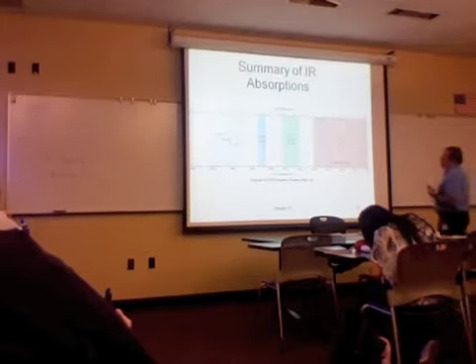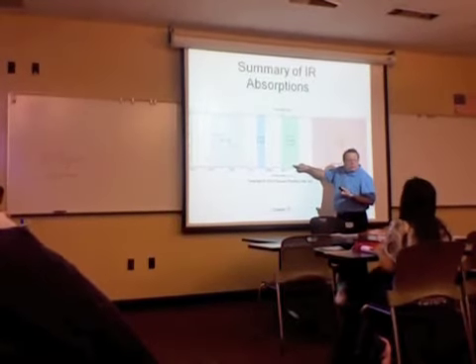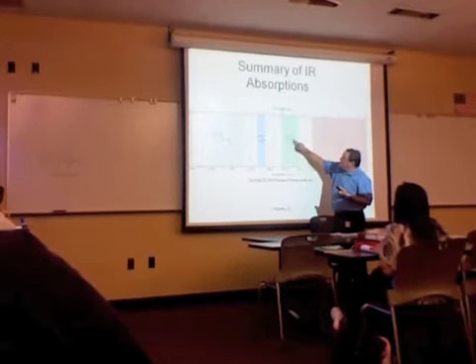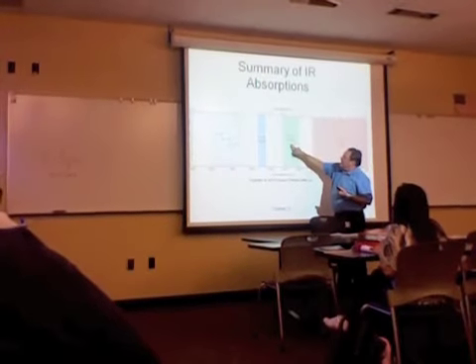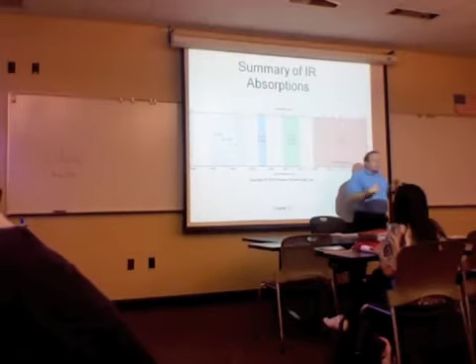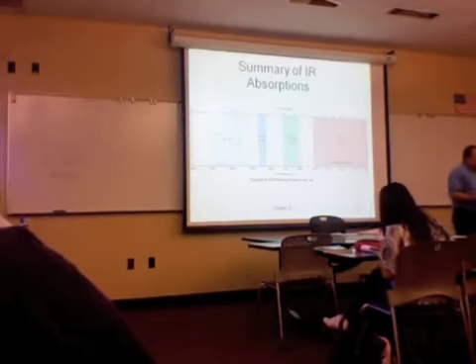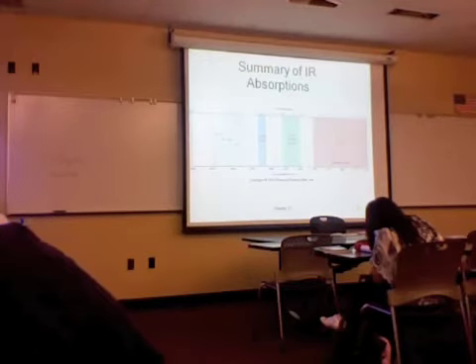An intense band right down here would be what? We have carbon. Probably that guy. Which would be more polar, that guy or that guy? Those are 2. Carbonyl. So a band around 1700 is the deepest, most intense band in the structure, almost always a dead giveaway for a carbon-oxygen double bond.